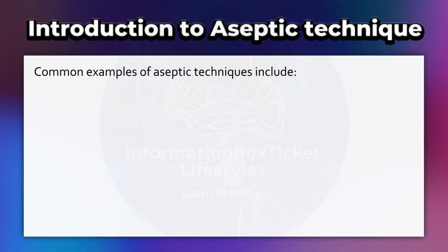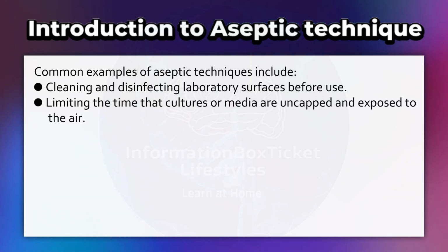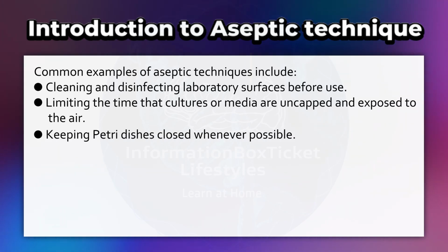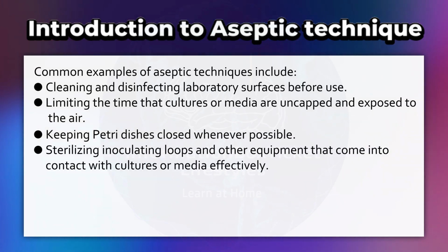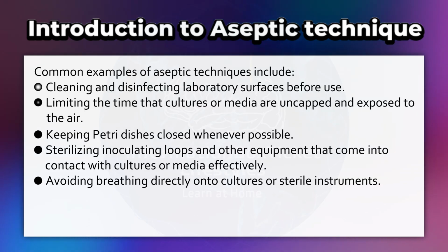Common examples of aseptic techniques include cleaning and disinfecting laboratory surfaces before use, limiting the time that cultures or media are uncapped and exposed to the air, keeping petri dishes closed whenever possible, sterilizing inoculating loops, and other equipment that come into contact with cultures or media effectively, avoiding breathing directly onto cultures or sterile instruments.